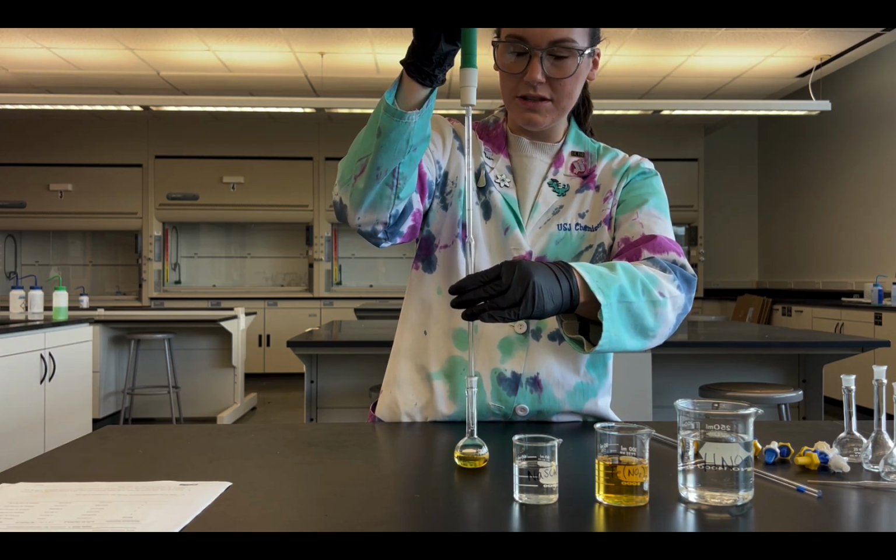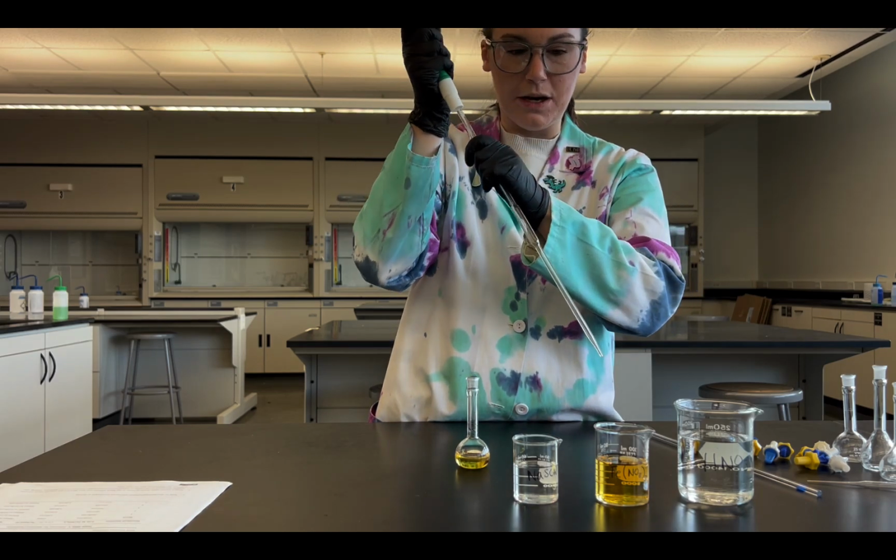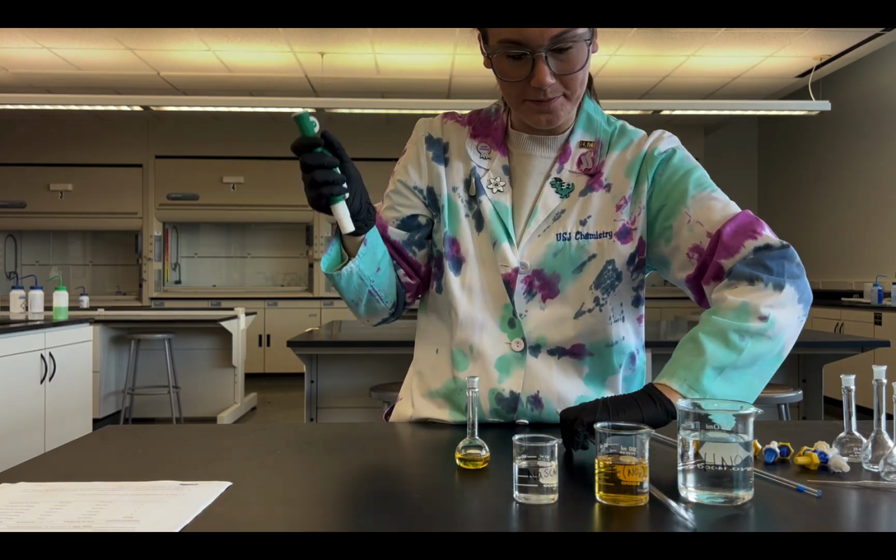Okay, and I'll just push this down to get all my excess solution out. And I'm done with my iron nitrate portion.